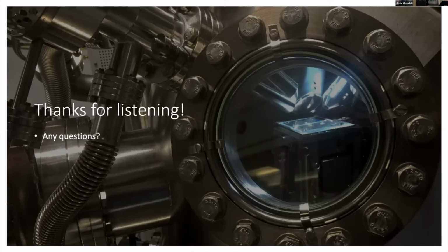But for the vast majority of samples that you look at, you won't need to really worry about things like this. Second row, third row transition metals are not the issue. Hope that answers your question, anonymous attendee.